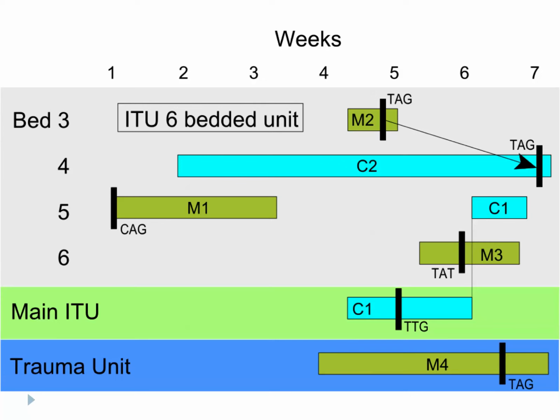Well, we just looked at 6 isolates here. We've looked at a much larger outbreak, which I'll talk about later. But this was just us getting started. At that time, it was very expensive, and 6 was the maximum we could afford to do. So we just looked at these ones. But you're right. If you looked at this just from the point of view of an epidemiologist wanting to see what's going on, you may well have concluded that this patient transmitted to this patient rather than the other one. I also think it's interesting that only 1 isolate made it across and wasn't like a mixture of isolates. Yeah. Well, that's another important question. We'll come on to that in a minute.